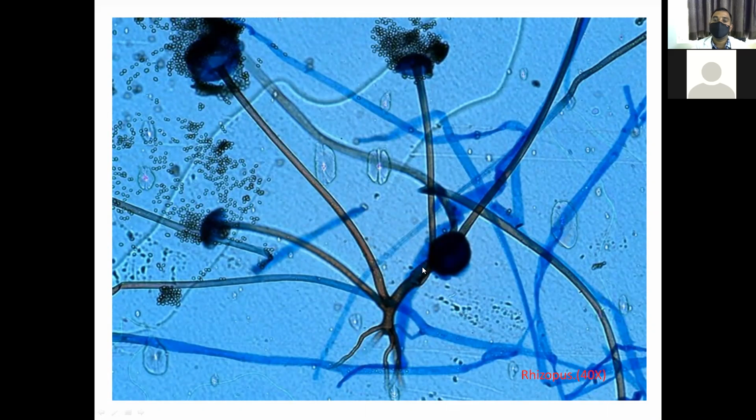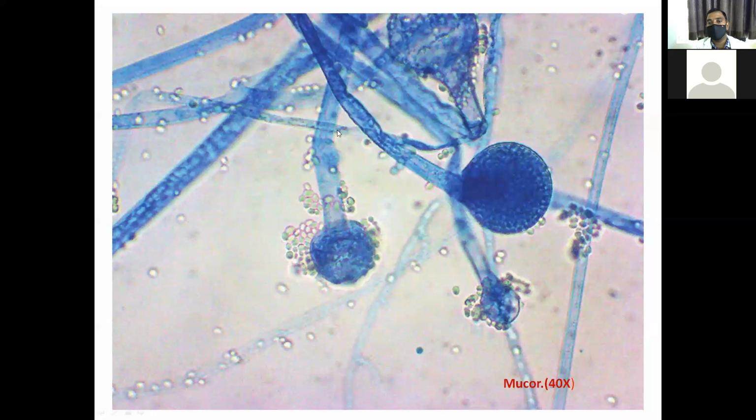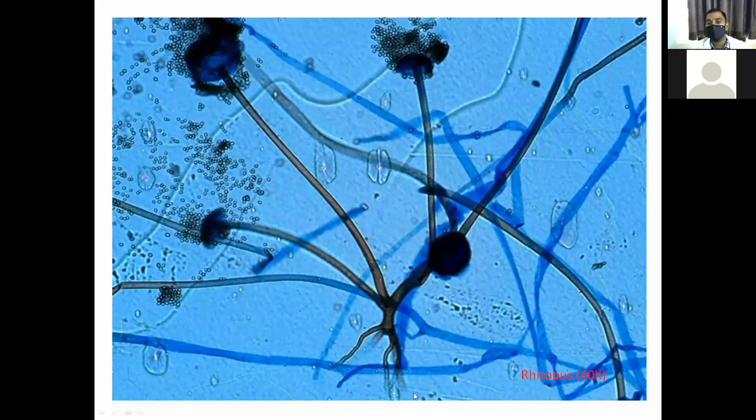For Mucor, the same: sporangiophore will be there, and sporangia on the upper surface, the mycelial surface, will be present. But there are no rhizoids for Mucor. And here, rhizoids are very clearly the identification mark for Rhizopus. This one is also 40x, high power.